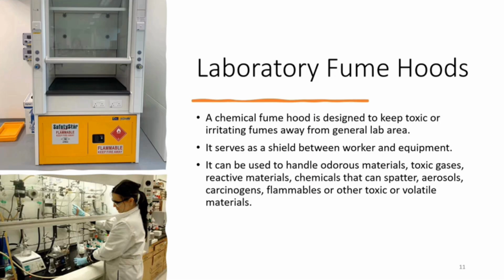The fume hood is usually used to handle the hazardous chemicals, for example, toxic, reactive, flammable chemicals, or other volatile materials. For example, if you are handling the strong acid and alkaline, then you should be doing that in the fume hood, not in the open lab area.